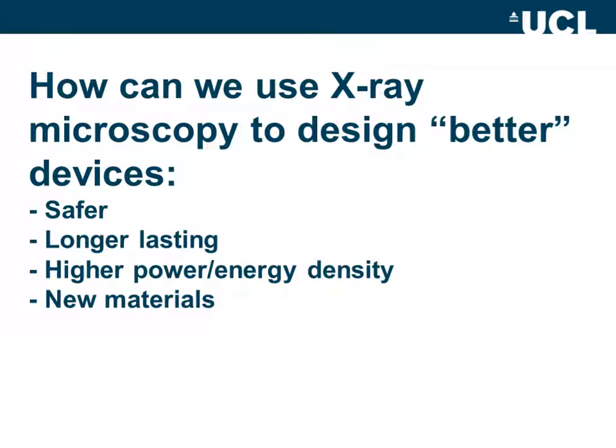The main question that I want to try and address today is how can we use X-ray microscopy to design better electrochemical devices? Electrochemical devices is kind of an umbrella term that we use to describe fuel cells, batteries, redox flow batteries, supercapacitors, which are at varying stages of commercial development, but actually share a lot of common traits, particularly in the porous functional materials that we're exploring when we're developing and designing these electrochemical devices.